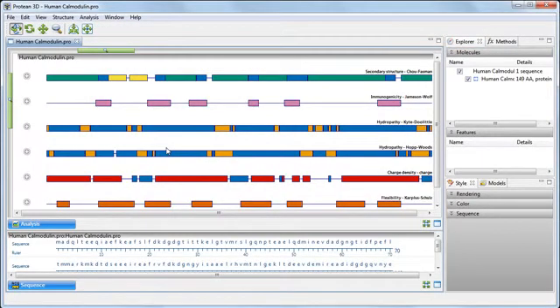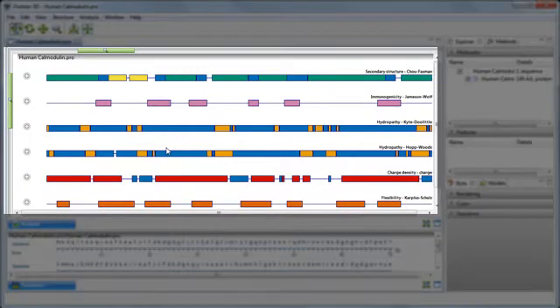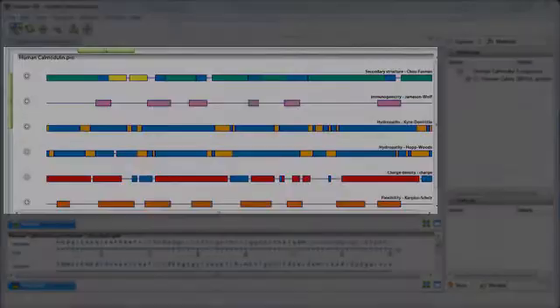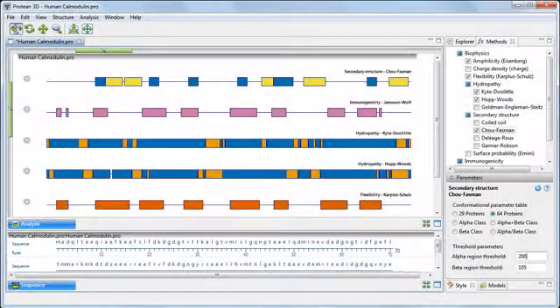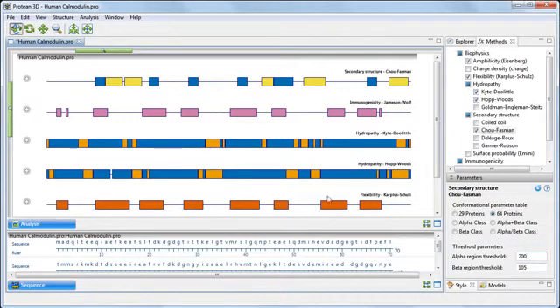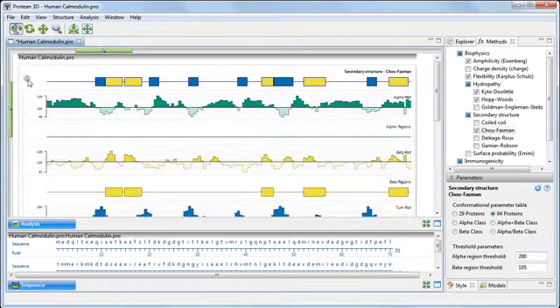The analysis view is the colorful window at the top left. To reveal individual graphs, click on the plus sign to the left of any synopsis row.